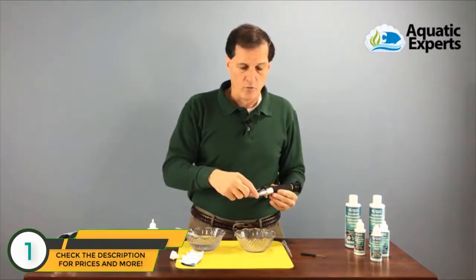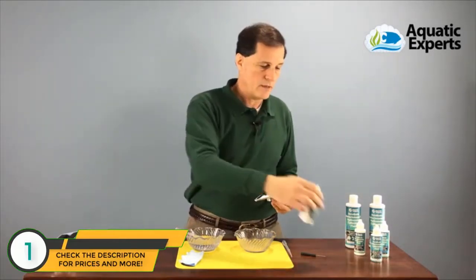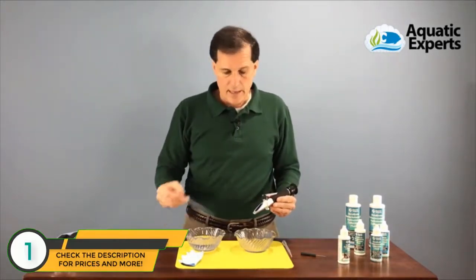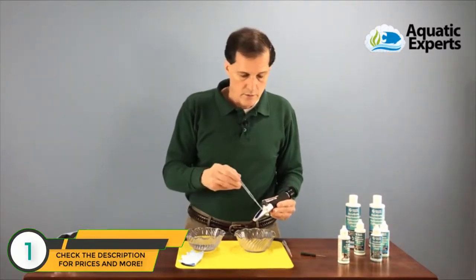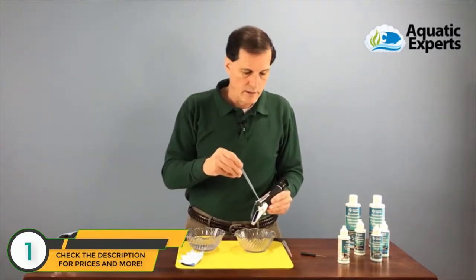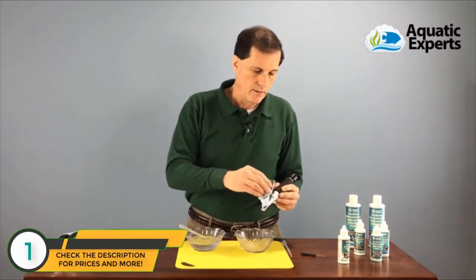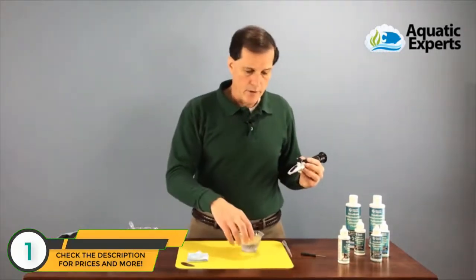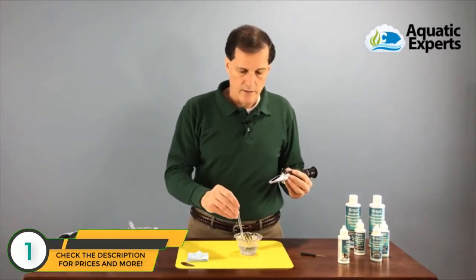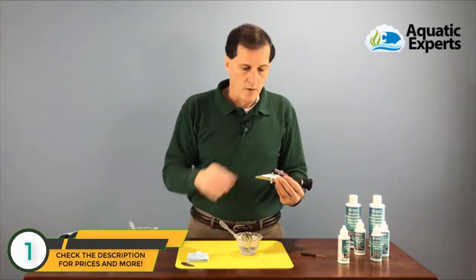Now I'm going to rinse off the refractometer again with distilled water to clean off the calibration solution, dry it off, and then we're going to bring in a sample from our aquarium to actually measure the specific gravity or salinity of my saltwater aquarium. I'll add a couple of drops — I splashed a bit, so I'll add one more drop to make sure it's well covered.